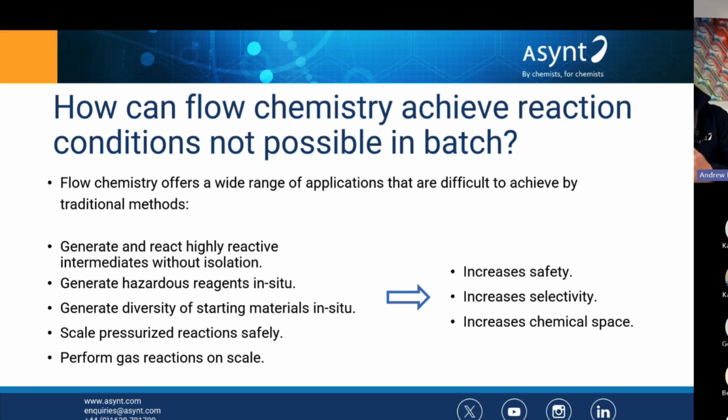But if we take that principle, we can do things like create highly reactive intermediates without any isolation. So we can make those materials that would have a low shelf life or that are difficult to find, or starter materials that are just not apparent in fine chemical catalogs. So we can create those reactive intermediates without any isolation, and flow them into a secondary reactor with another substrate. Now, that simple two-reaction system is an easy step to transition from that A plus B one reactor. That's difficult to do under batch conditions.